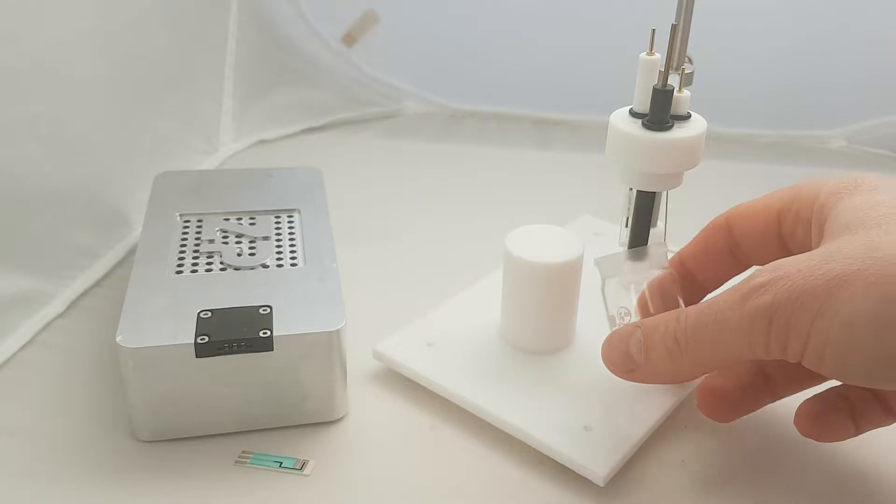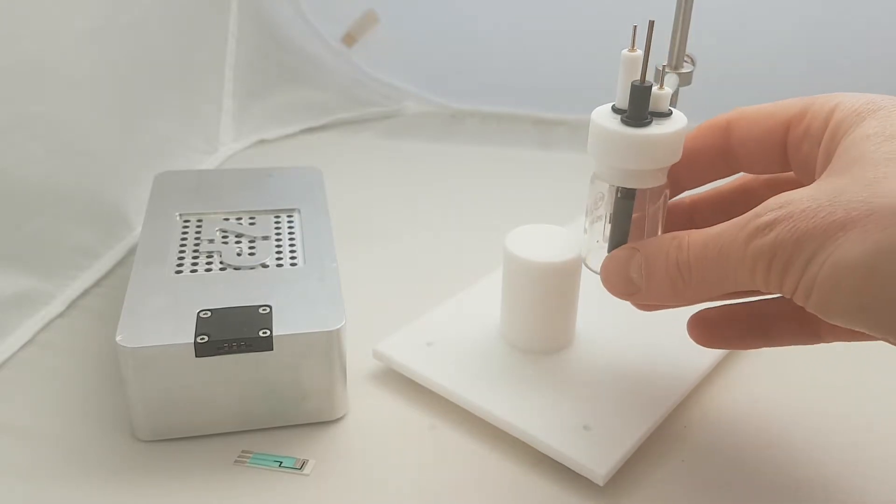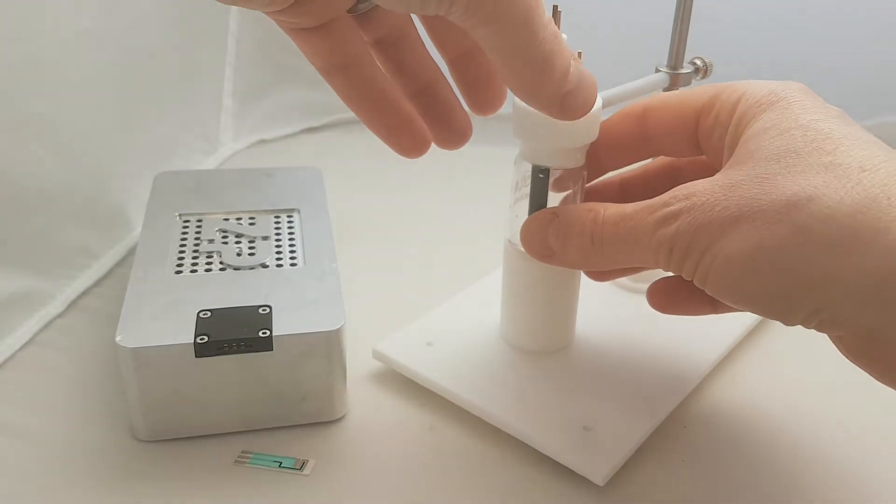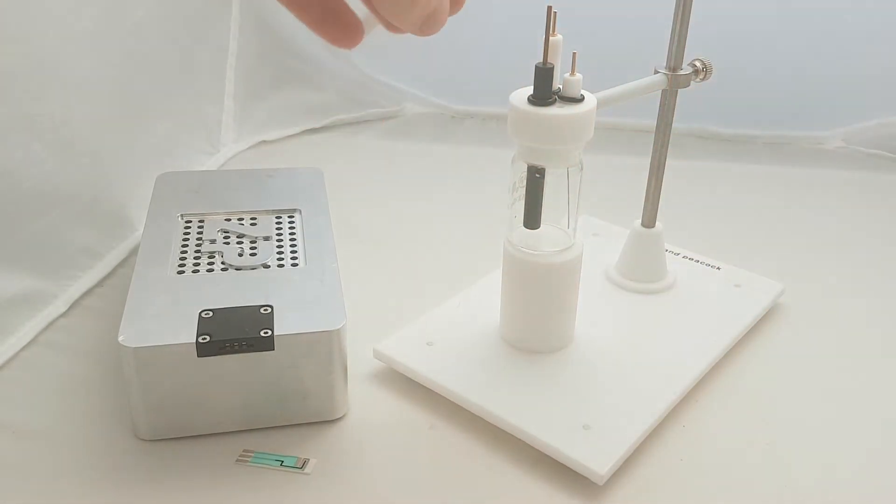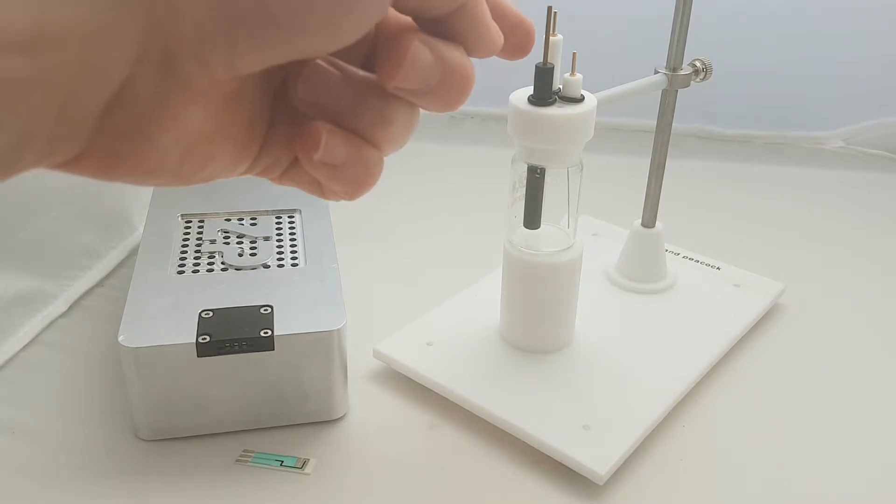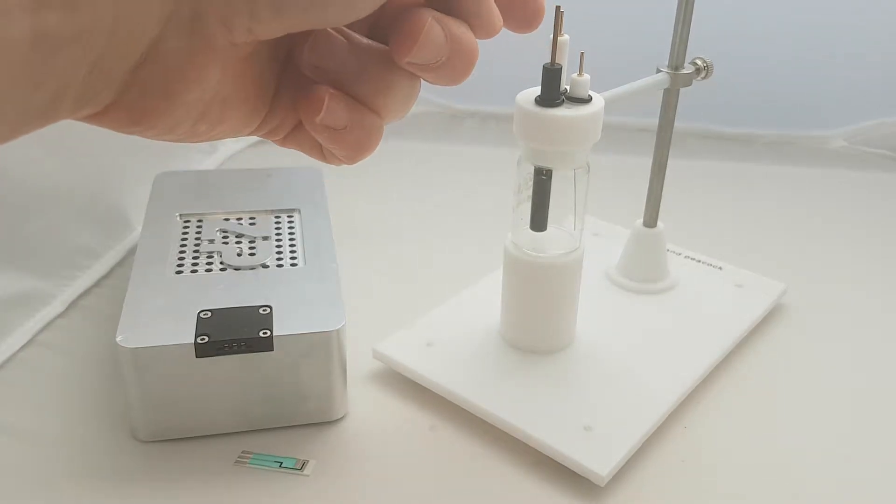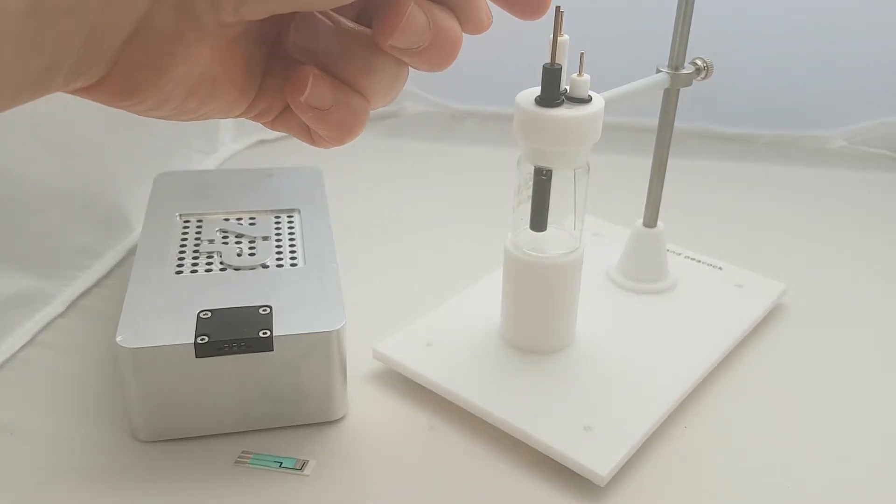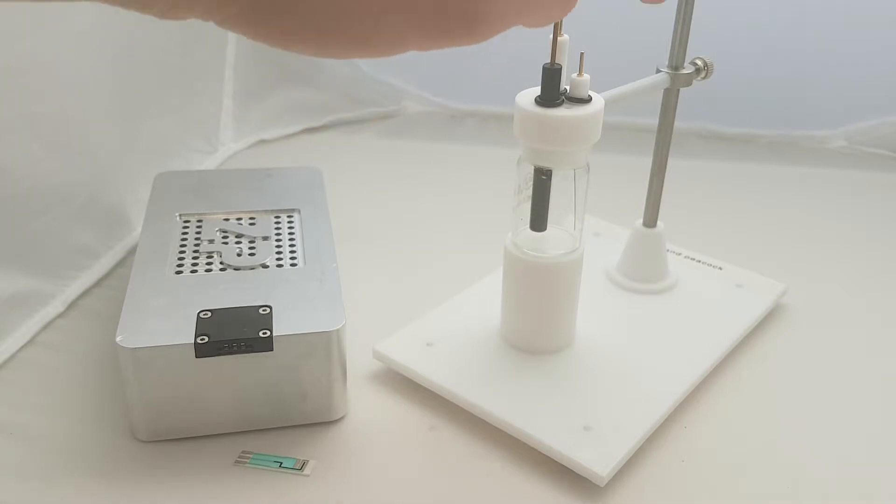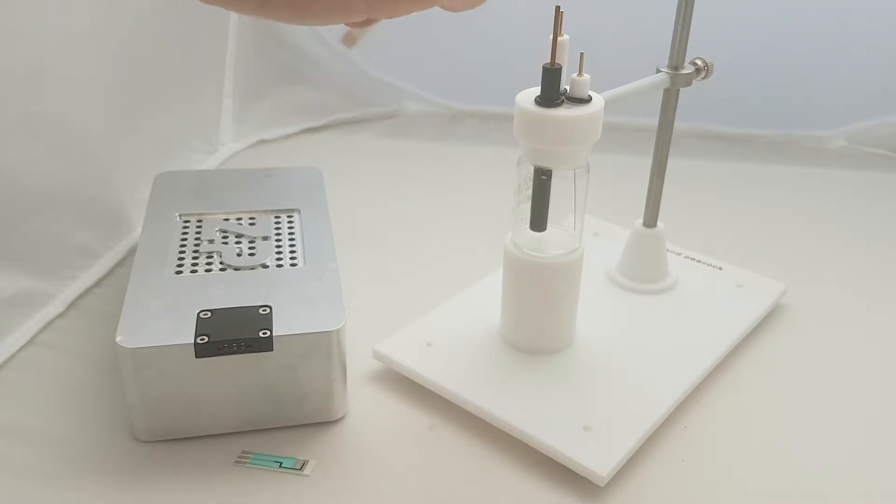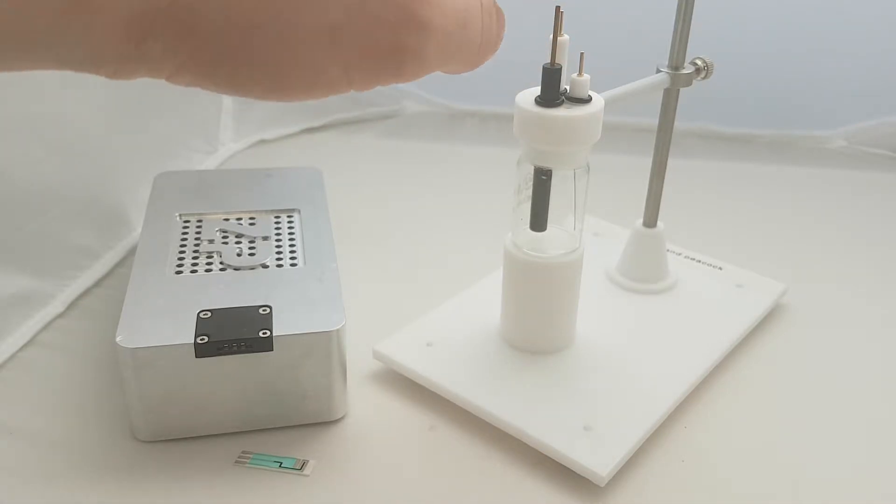You can put that on there and like that we can make connect to the working electrode, connect to the reference electrode, and connect to the counter electrode.